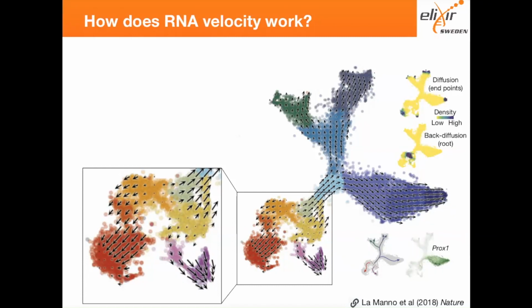If you have 3' RNA, coming from the 10x, how much is it actually possible to measure unspliced variants? I mean, the information that we have is relatively short. You can typically detect 10 to 15% of transcripts with intron in 3' 10x. Yeah. So in the paper, actually, there's a figure that I didn't show here. They compare Smart-seq, CEL-seq, I think, and the 10x as well. And they all have the same rates, let's say. I don't know if there is much validation on every single different trajectory, but for this one, it seems to work.